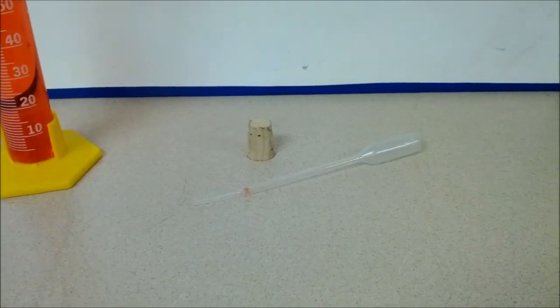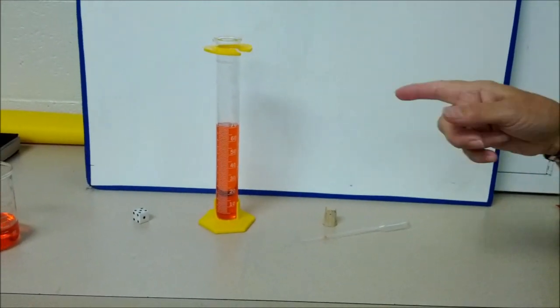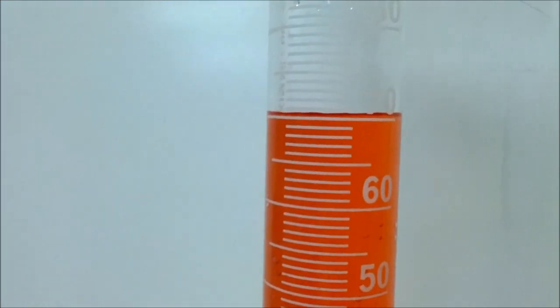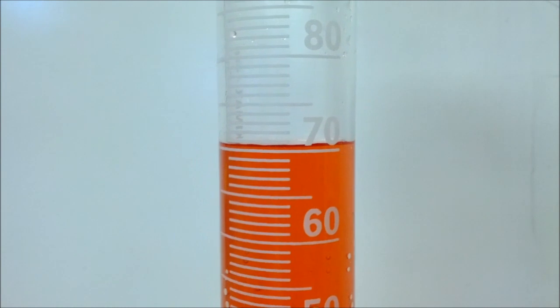Okay, so we're going to take this cork and put it in. We've got to figure out where we are. All right, let's take a look here. The bottom of our meniscus is right at 70 milliliters. Okay, good.